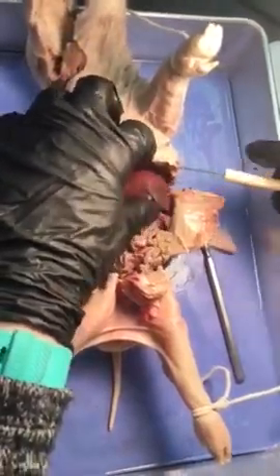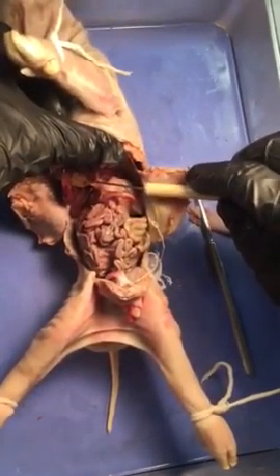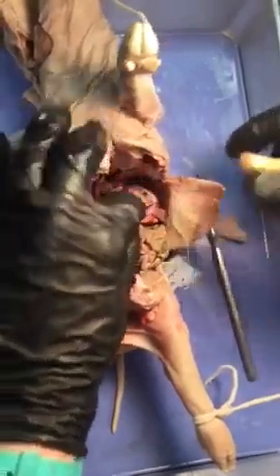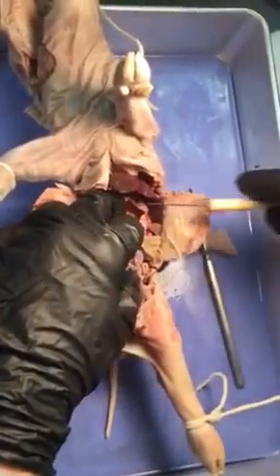All right. So here's the liver. What's this? Gallbladder. Okay, this is the gallbladder, stores bile, of course. And then here, stomach. Okay, so this is the stomach.